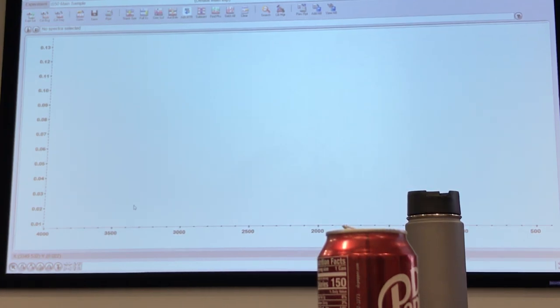But has anyone pushed the limits? Yes, they push it down to 5? Yes, you can get it. Like the spectra we saw, the data we saw for the microbeads in the muscle tissue, those were done at 5. Those microbeads could be seen at that resolution, just size 5, so we could see them very well. And that wasn't backed up with ATR? No, that was just a reflectance spectrum. We have done a lot for other industries, for life science and so on, a lot of 5s. We do 5s and 8s in reflectance as well.